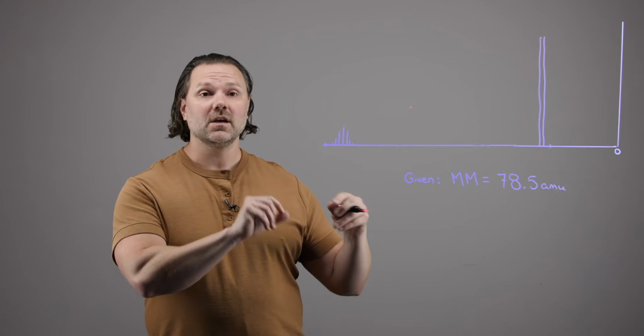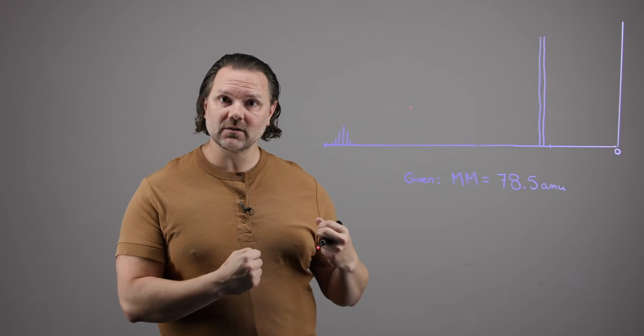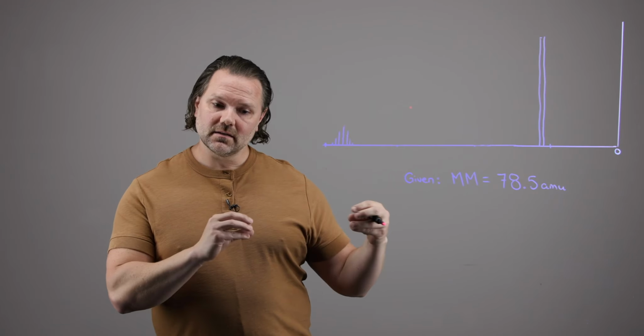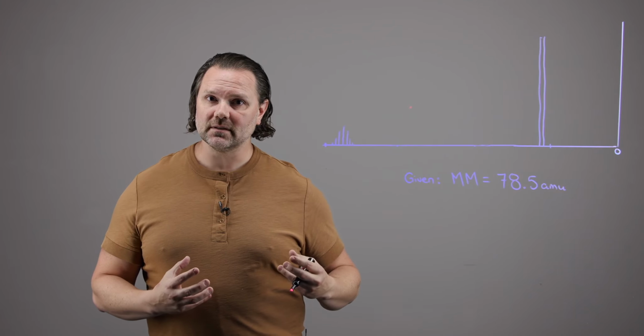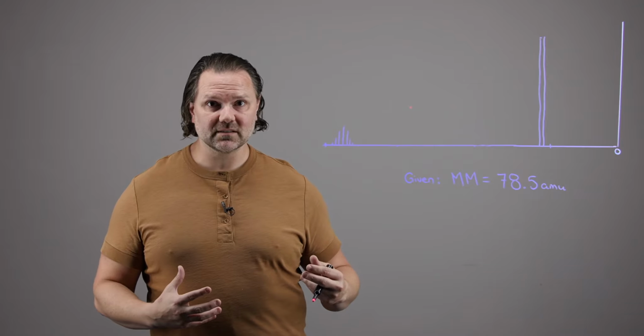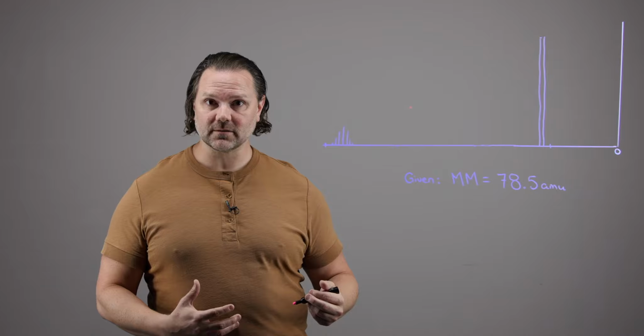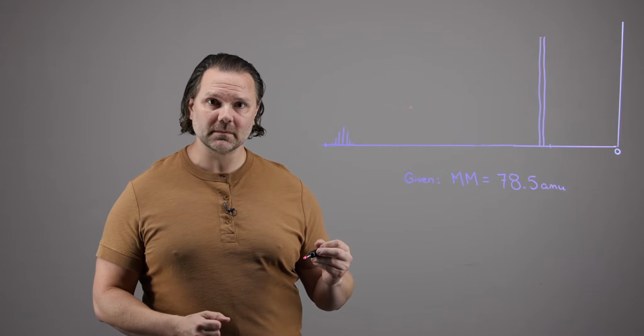Because what you're doing is detangling a whole bunch of information, pulling it out of that spectrum, and then those are like pieces to a puzzle, and you need to be able to fit them together. But if you don't organize your puzzle pieces effectively, it's going to be much more difficult to solve the puzzle. So let's build our table.